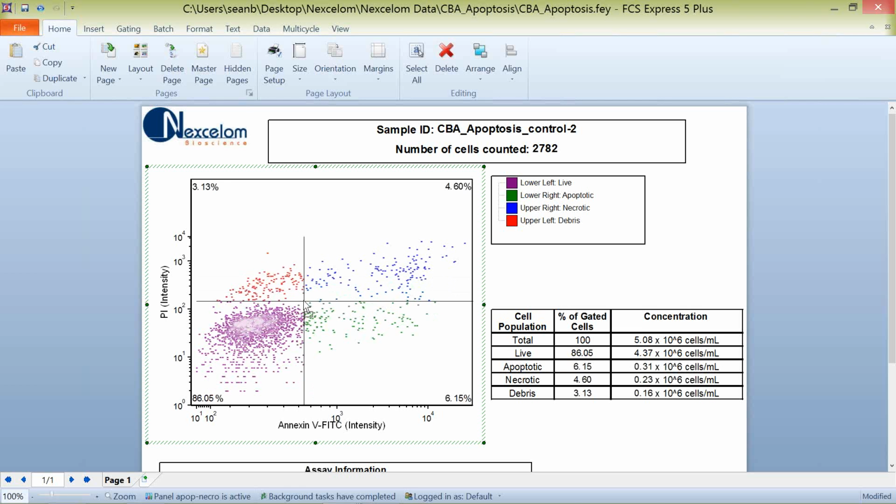This is actually by design. And what happens here is we enable a feature called emphasize on plots. And if we reach a threshold of 2%, these plots, or these dots, are going to update to show us where they are. It gets very useful when you're starting to work with low numbers of cells and populations, which you quite frequently encounter with imaging data. We're going to pop out where those cells are so you can see them on any plots.